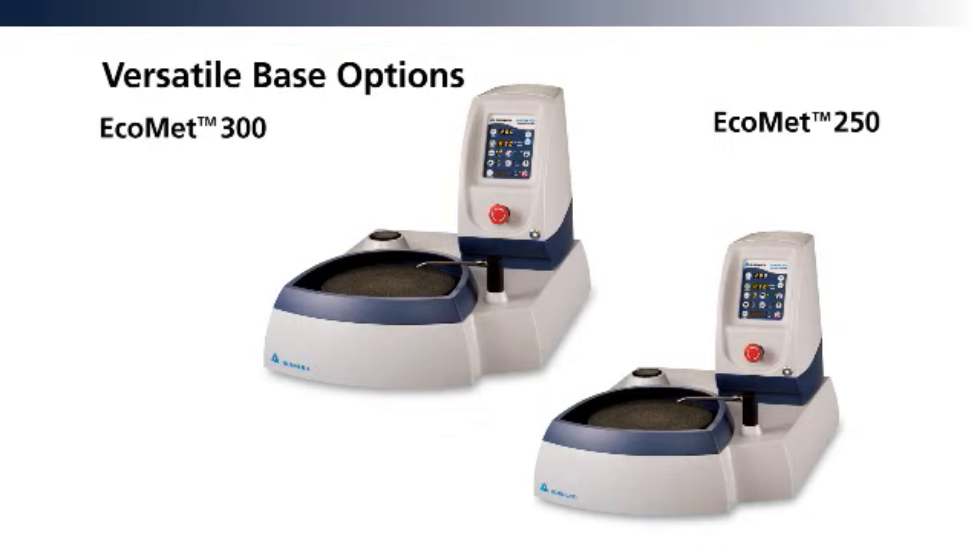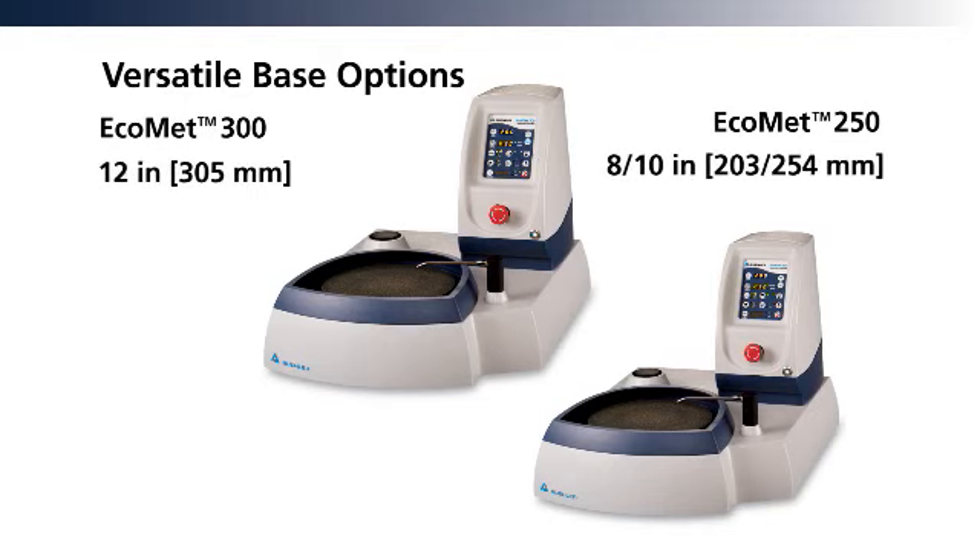Select the durable base that best fits your application. The Ecomat 250 is capable of handling 8 and 10-inch platens, while the Ecomat 300 handles 12-inch platens.